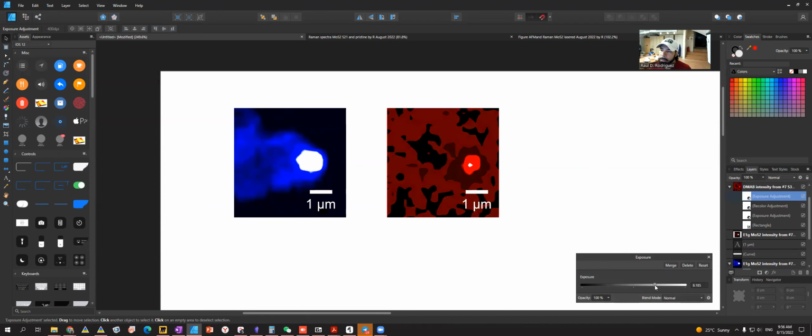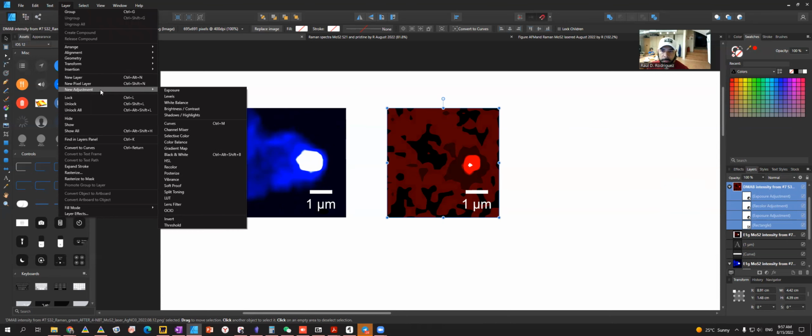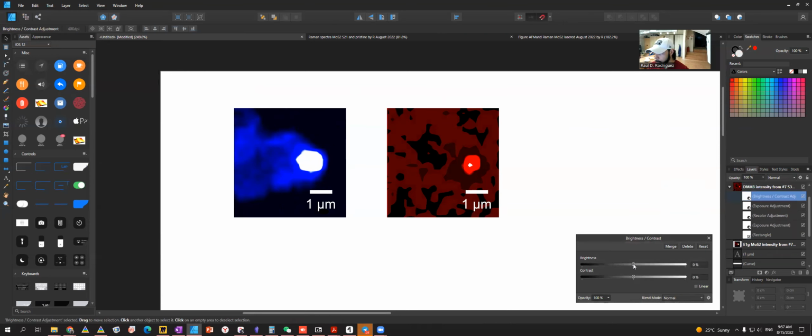Do it like this. Well, actually, yes, like this will be good because this is at the noise level. So it will show already these black things. You're already at the noise level. You only have a signal from here, from this part. So exposure layer, adjustment layer. Okay, this is very simple. Here is where you have a signal.